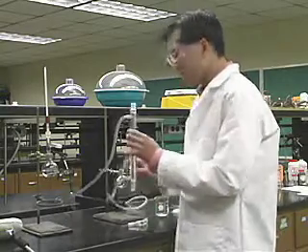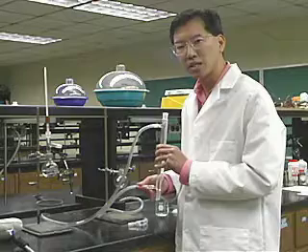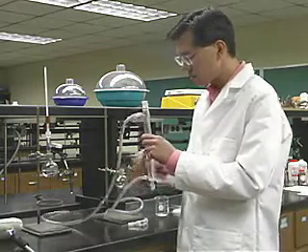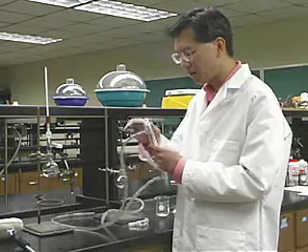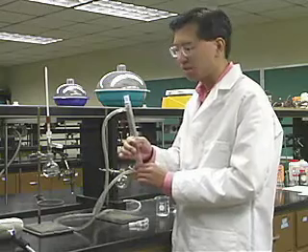This is a condenser, and I've connected some Tygon tubing to it. One end goes to a water source — cold water is important to use here; if you use hot water you're not going to get the effect you want. The other end goes to the sink to drain. Water comes in through the bottom and goes out through the top — that's always the case with a condenser. The condenser consists of an inner tube, and jacketed around it is more glass where the water runs. So the vapor being distilled goes down the middle, and cooling water runs around the outside in the cooling jacket.